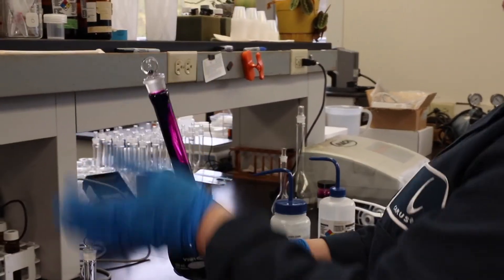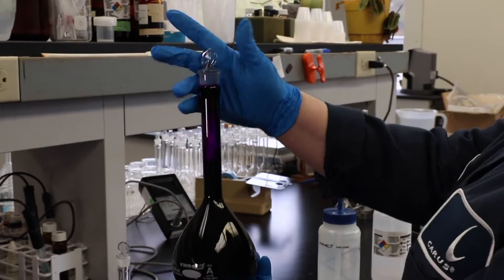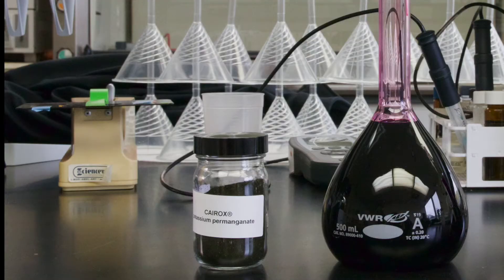Agitate the solution to ensure all the permanganate is dissolved. This will produce a 1% potassium permanganate solution.